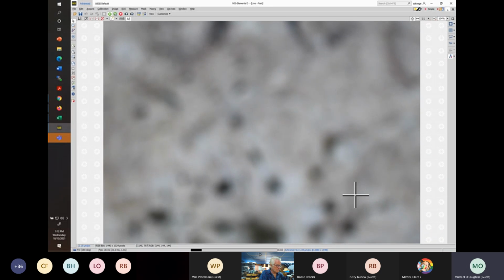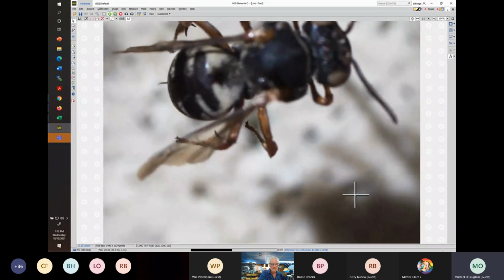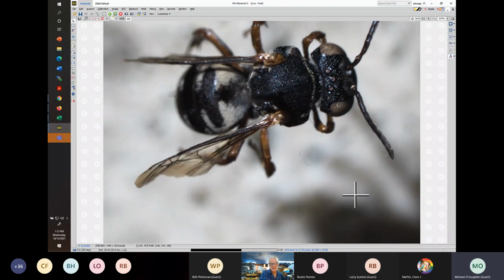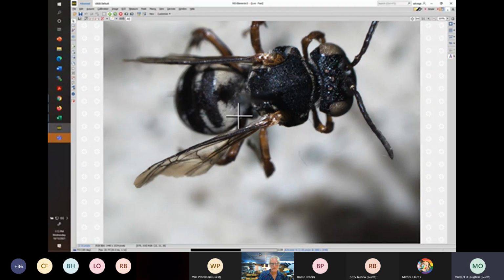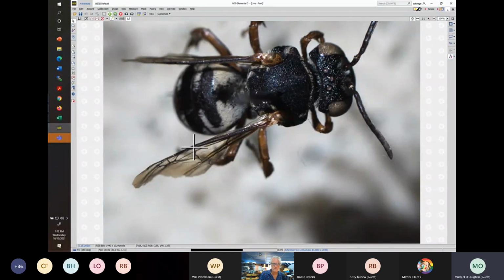With the female, we have a different specimen, this is also Rhododontus. Let me get this in focus again. Again, you can see these different patches of appressed white hairs. Usually the abdomen is very noticeable in terms of its patterns. On the scutellum, particularly where the pin is placed in, there are often appressed white hairs along the rim, and to the interior there's usually a set of two on either side in some species.